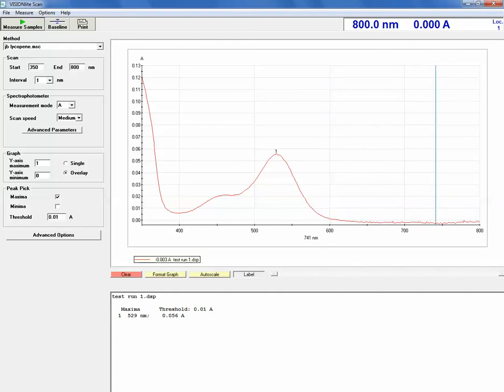All right, so when we do our measurements, this is the magic number that we're after. We're after this hump that's the tallest on the spectra, right? This is something that we've talked about in the theory portion. So according to this hump, or according to the full spectrum scan, this is the hump that's associated with the highest absorbance.